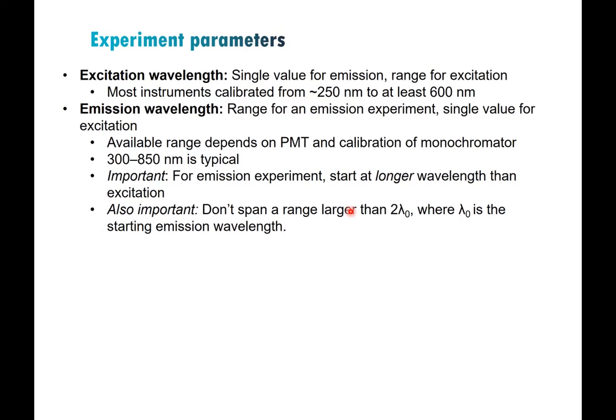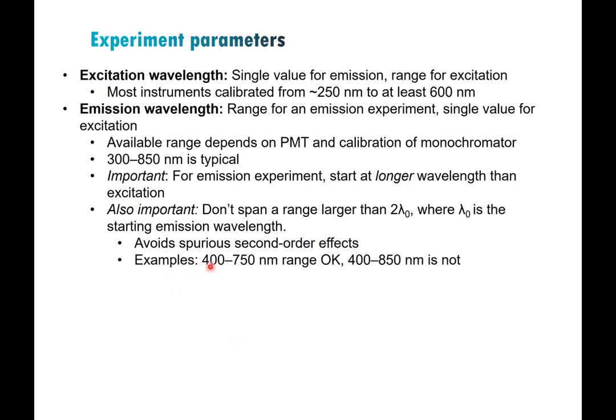Because of second-order effects, in addition to detecting λ you'll also detect 2λ. So if you have emission at some wavelength and you detect out to two times that wavelength, you'll see signal there that is not real. If you have a sample that spans a wider range, your only choice is to do it in two pieces and use filters to block the higher-energy light when collecting the lower-energy portion. For example, we often start at 400 nanometers and can go out to 750 or 800, but not beyond that without risking second-order artifacts.